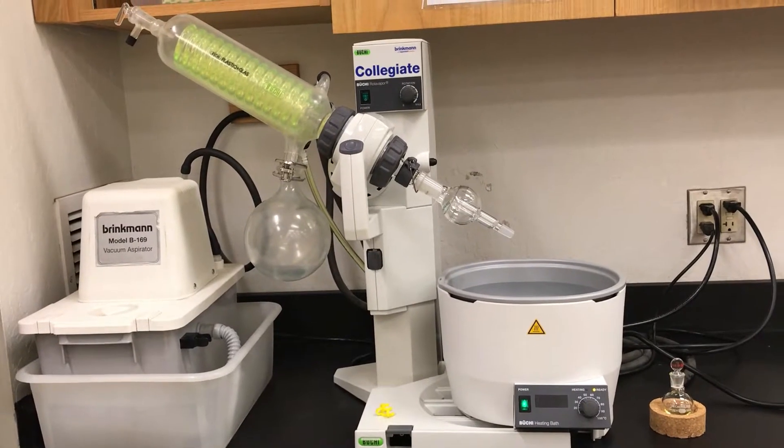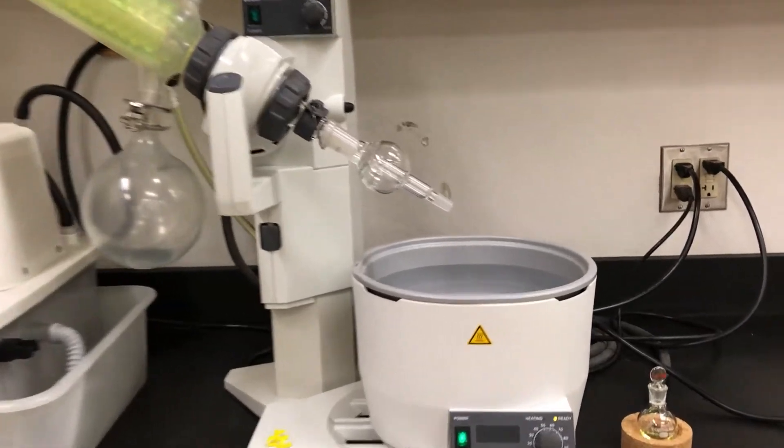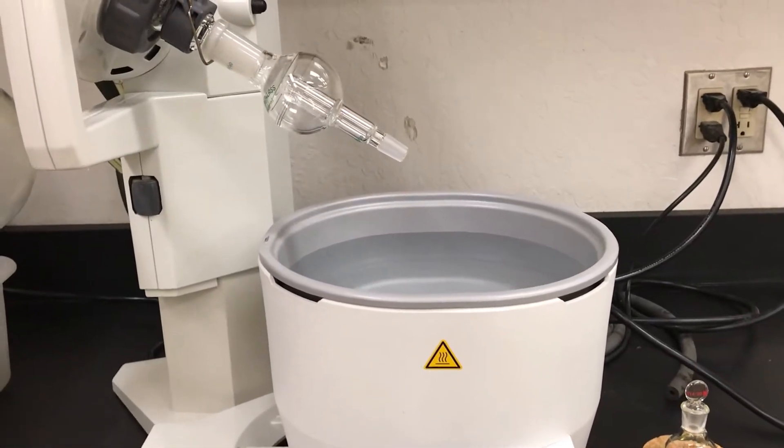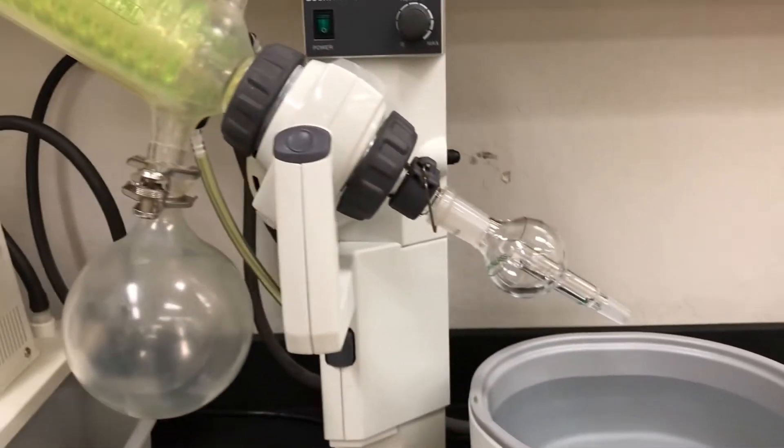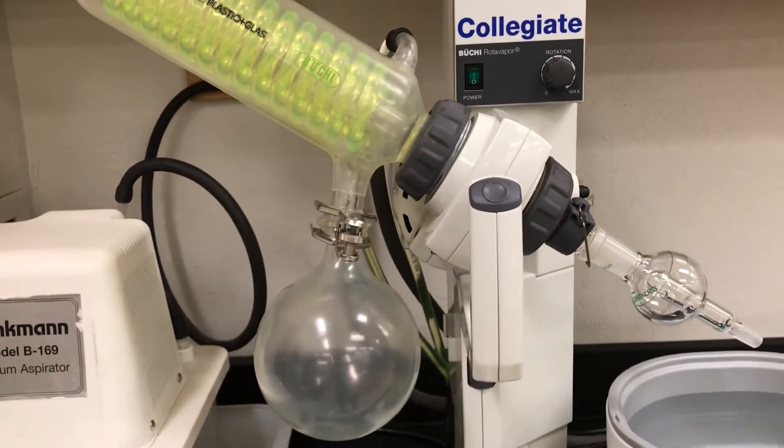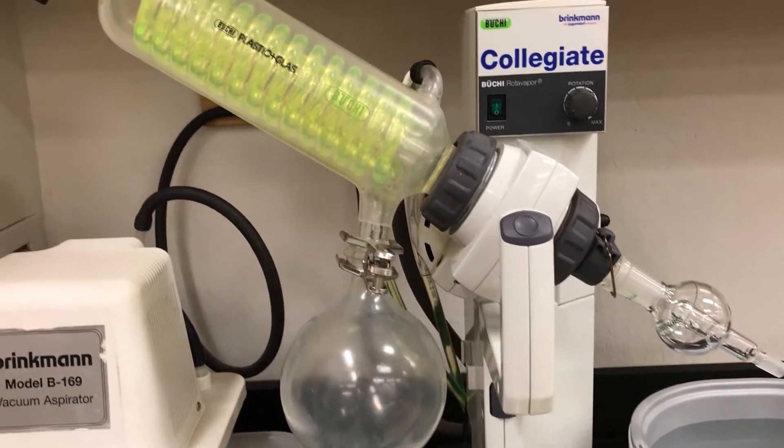So here is our instrument. We'll be attaching our flask to this area and heating it in a water bath. That will boil the solvent and turn it into a gas which will then move over and contact this yellow area.